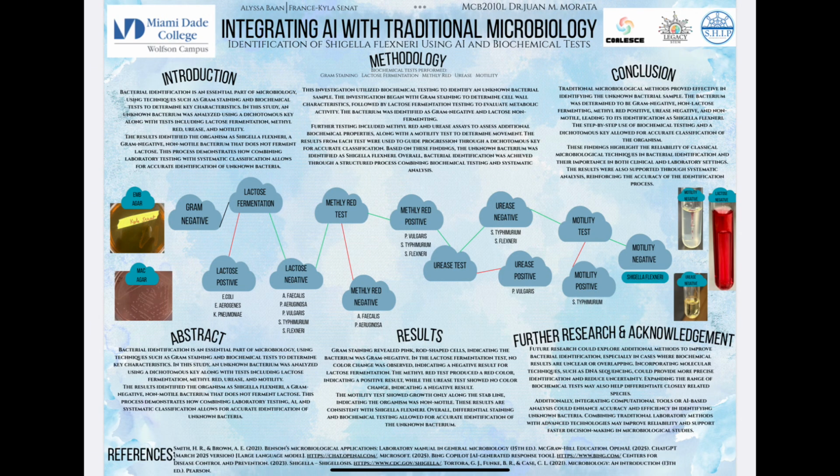In conclusion, traditional microbiology methods proved effective in identifying the unknown bacterial sample. The bacterium was determined to be gram negative, non-lactose fermenting, methyl red positive, urease negative, and non-motile, leading to its identification as Shigella flexneri.